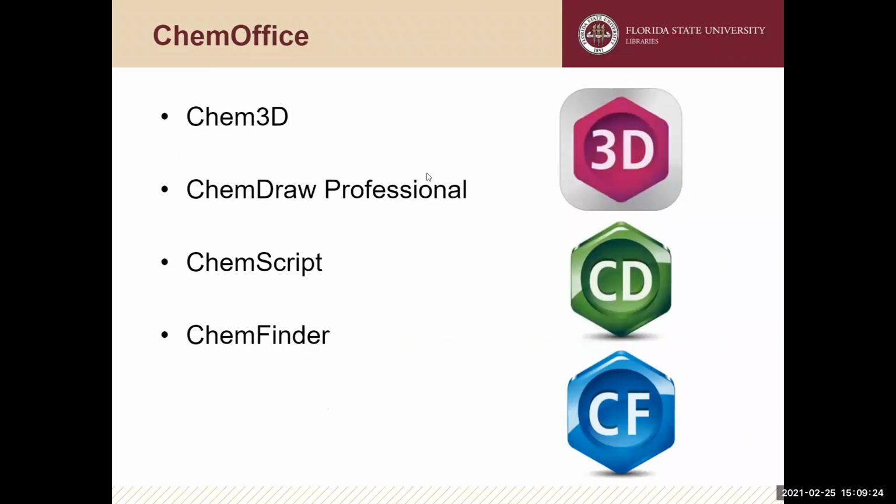ChemDraw itself is actually part of a larger suite of programs called ChemOffice. When you download ChemDraw, say, through the chemistry department or through the CambridgeSoft site, it'll often download as ChemOffice, of which ChemDraw is a part.